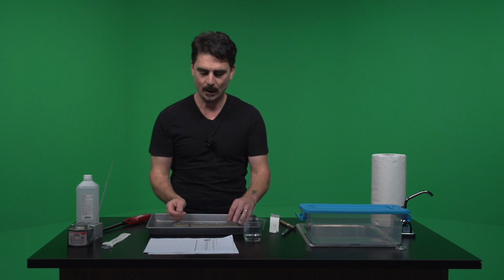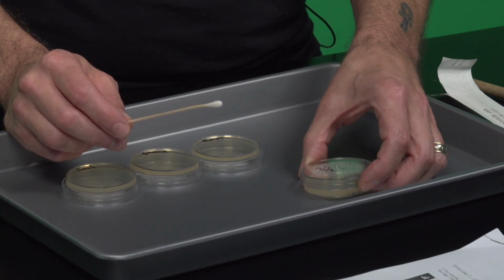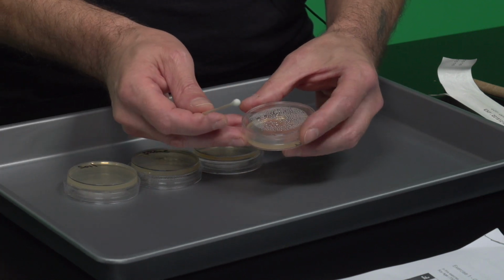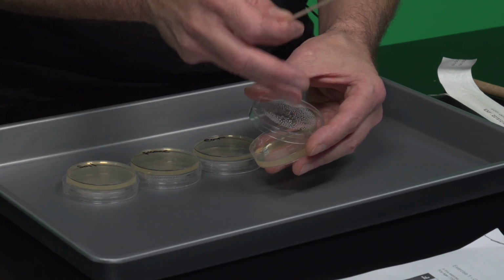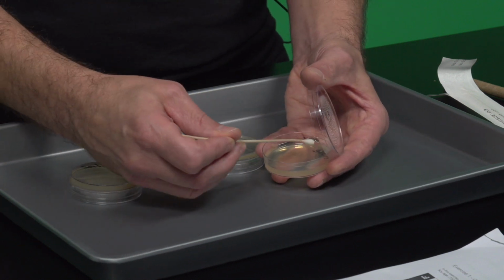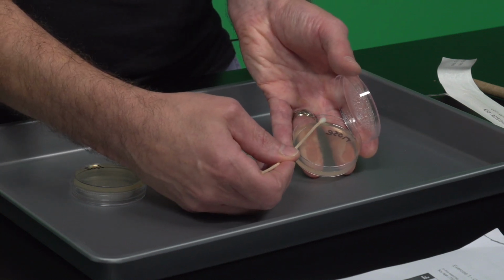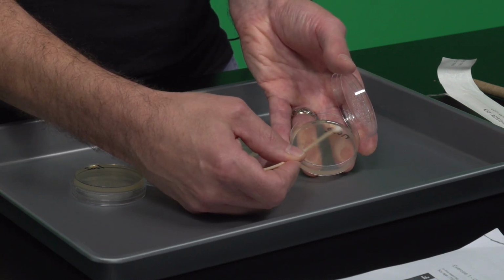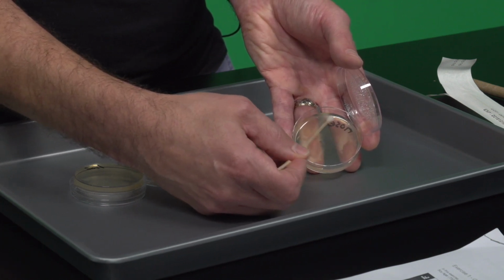Okay, so now that I've got my swab squared away, again, what I'm going to do is put it on quadrant 1, which is right under the black marker. So there's two ways you can do this, okay? You can either do it like the lab manual says, where you learn to keep your plate covered at all times so that if bacteria are falling down, it does not get in there. In that case, what you want to do is swab this first quadrant back and forth, back and forth, back and forth, right? And you don't want to go much further than where you marked it.